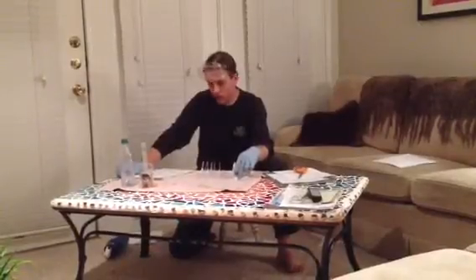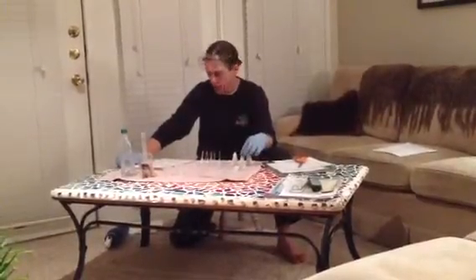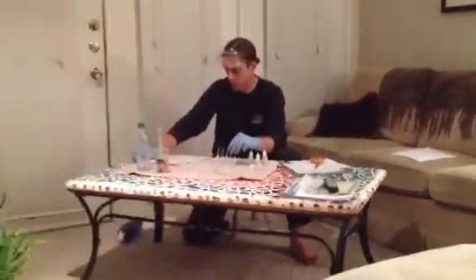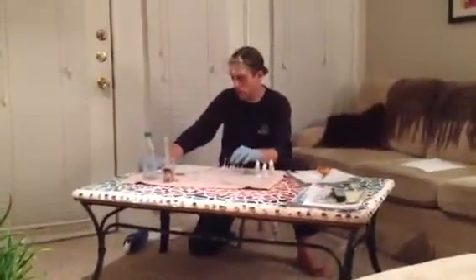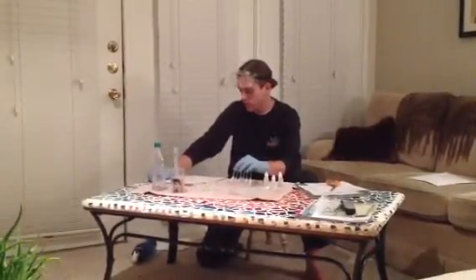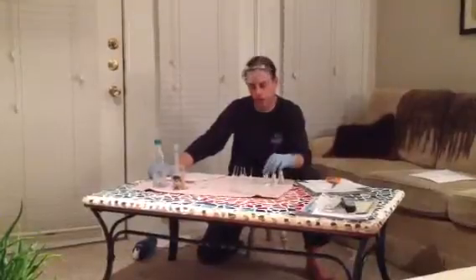I've also got a couple empty pipettes for moving chemicals around. I've got silver nitrate. I've also got sodium bromide, sodium carbonate, sodium chloride, sodium iodide, sodium phosphate, sodium sulfate, sodium sulfide, and then I'll also be using an unknown tonight.